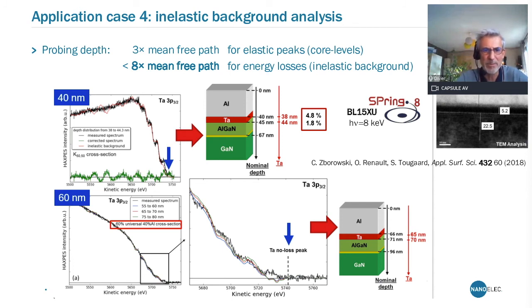The nominal burying depth is between 40 and 45, and we determined through this method a burying depth between 38 and 44 nanometers, so with a very high accuracy. So you understand that with inelastic background, you can get access to very large probing depths in photoelectron spectroscopy.